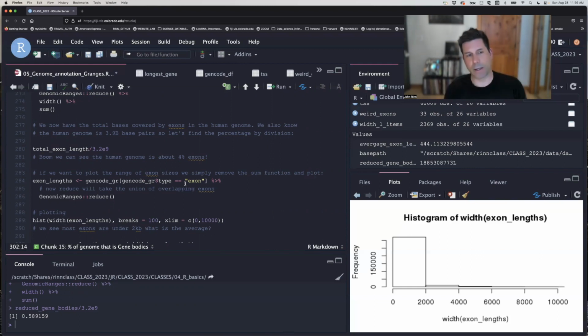Really, it's just getting the idea that you can take any two things and overlap them now with genome features and peak overlaps. You can find your consensus peaks that overlap in your ChIP data, and then find what features they overlap in the genome by making objects in genomic ranges to index, and we'll find overlaps too.